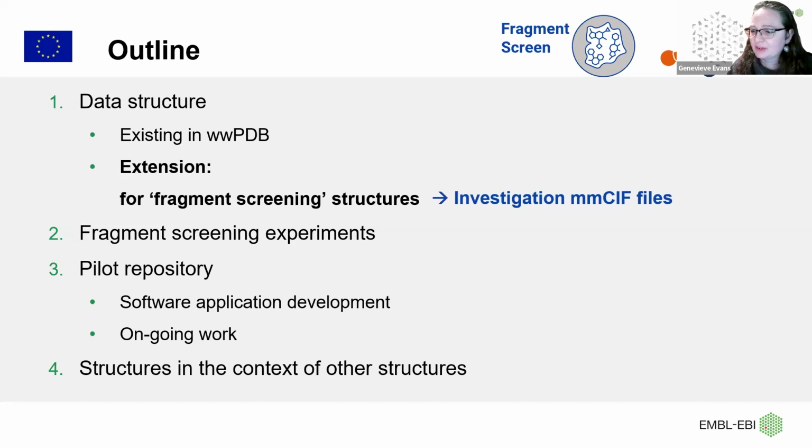I'm also going to briefly give an overview of fragment screening research, touching on some foundational concepts, and in particular the commonality and diversity in this type of data. An important aspect is that we've built a software application to help us generate these files. I'm going to finish by talking about how we often consider structures in the context of other structures.